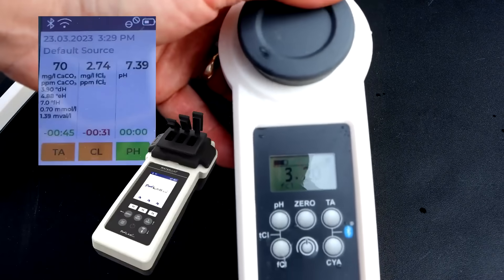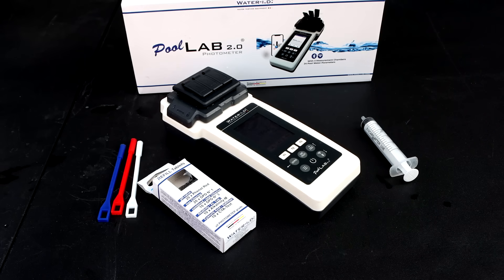The free chlorine is coming in at 3.2 on the Pool Lab 1.0. If you're in the market for a good photometer, I think the Pool Lab 2.0 or Water Tester would be a great choice. It does three test factors at once to speed up your testing, handles 24 different test factors total, and I really like the screen, how it displays the results, and how fast it is to do the test.